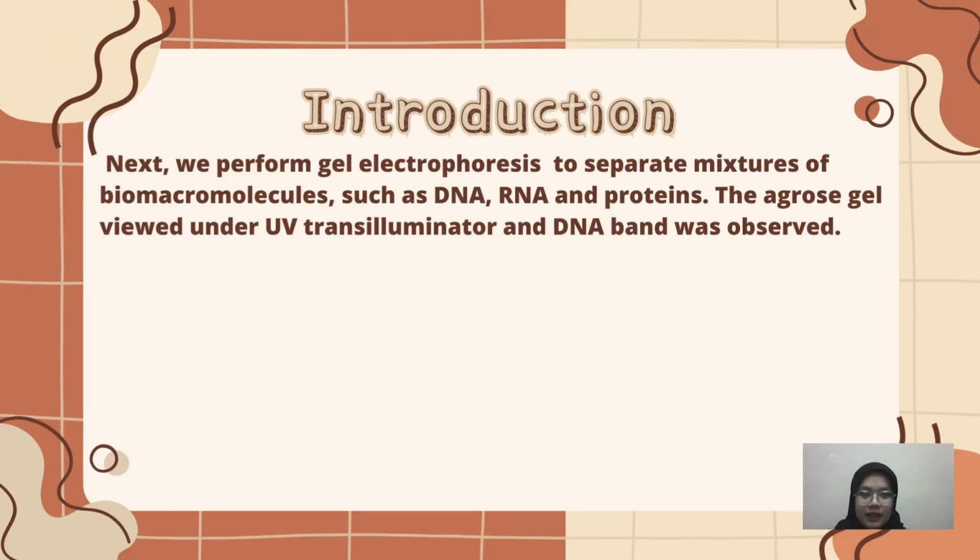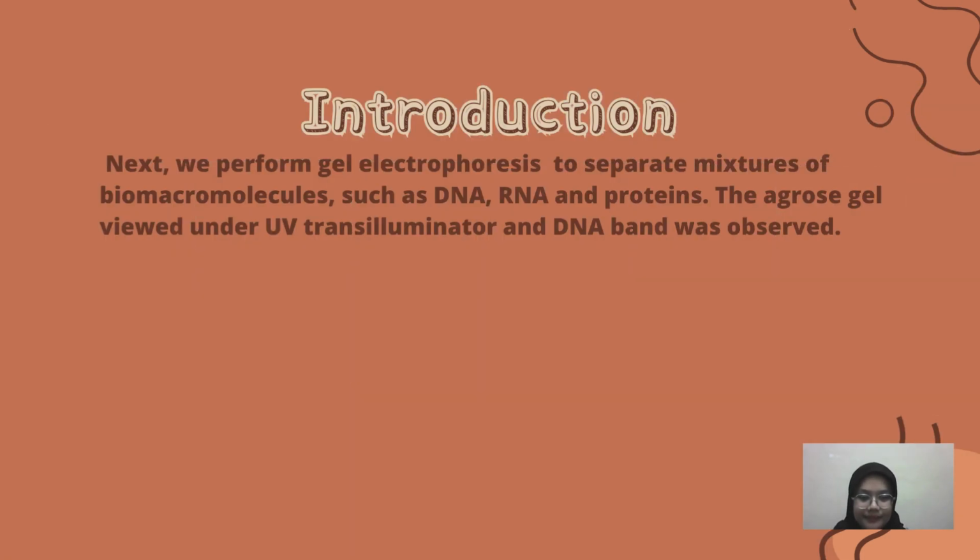Next, we perform gel electrophoresis to separate mixtures of biomacromolecules such as DNA, RNA, and protein. The agarose gel is viewed under UV transilluminator and DNA band was observed.